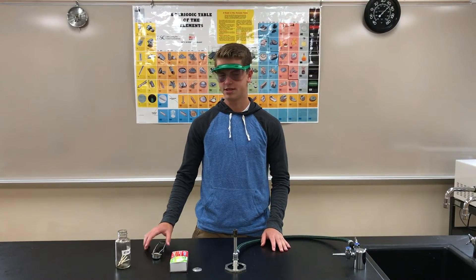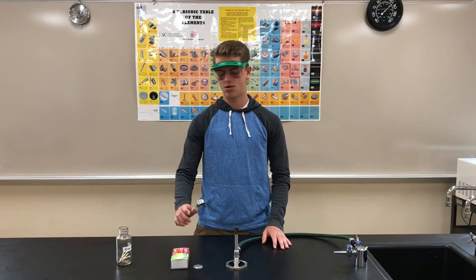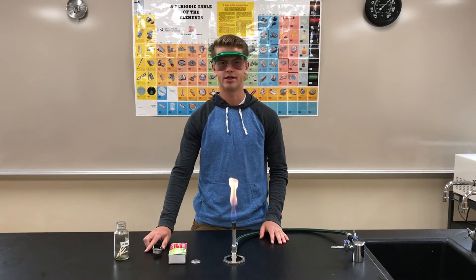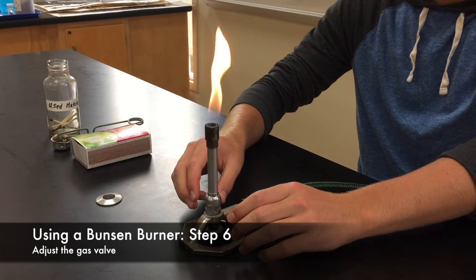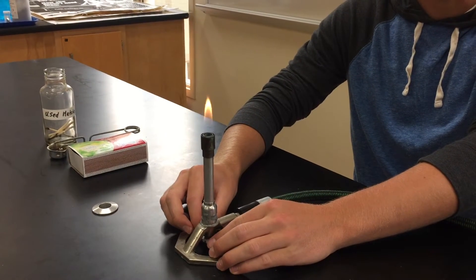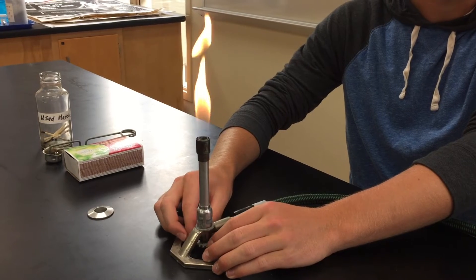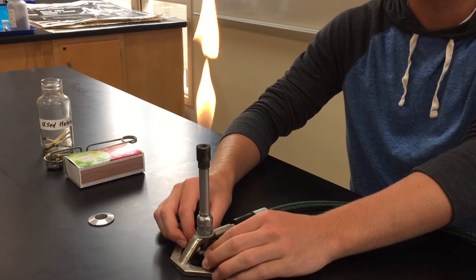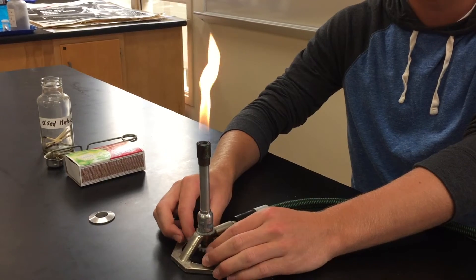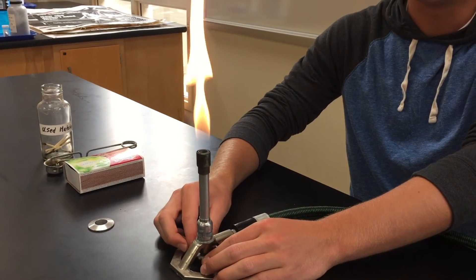Next, we are going to light with flint and steel. Hold your hand away from the flame and squeeze to strike and light the flame. The screw valve on the bottom controls the amount of methane let into the Bunsen burner — loosen the screw to let in more and tighten it to let in less. More methane will make a larger flame and less methane will make a smaller flame.